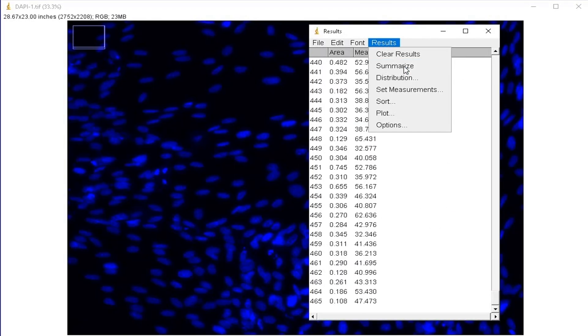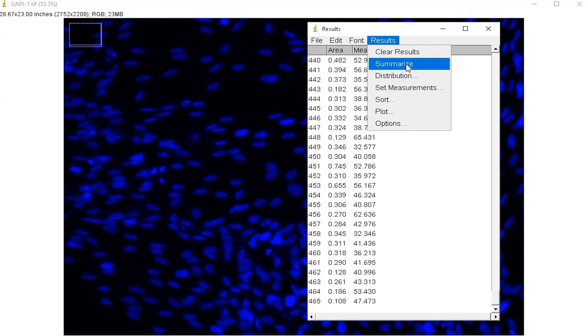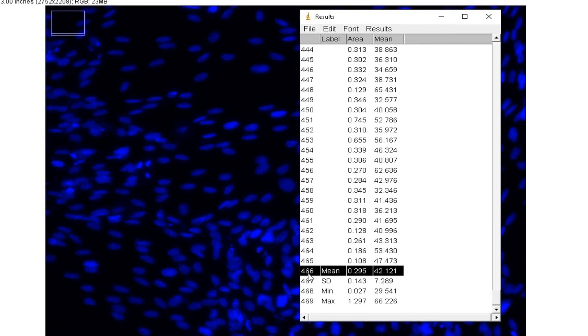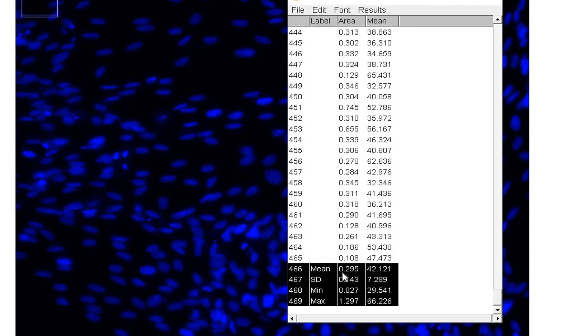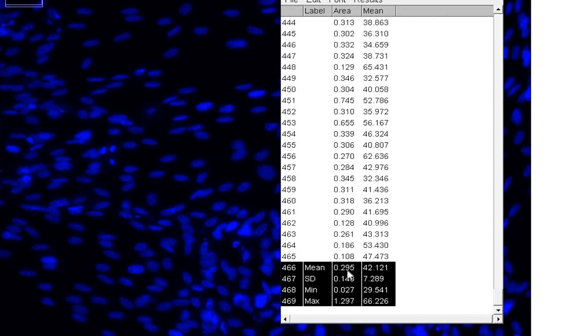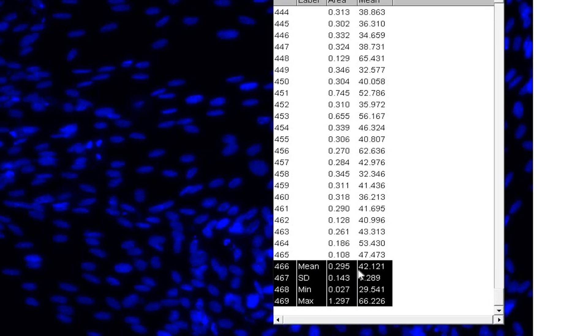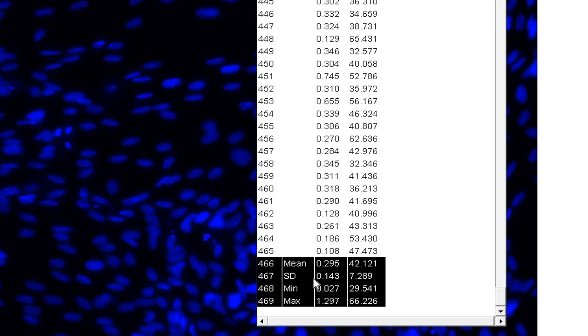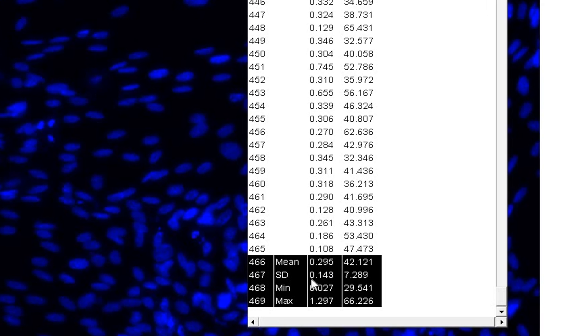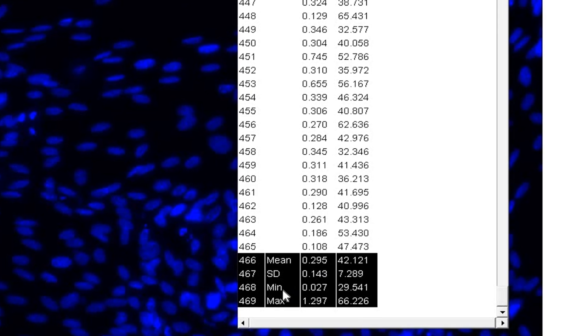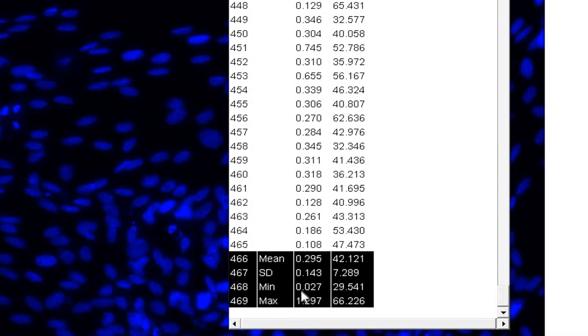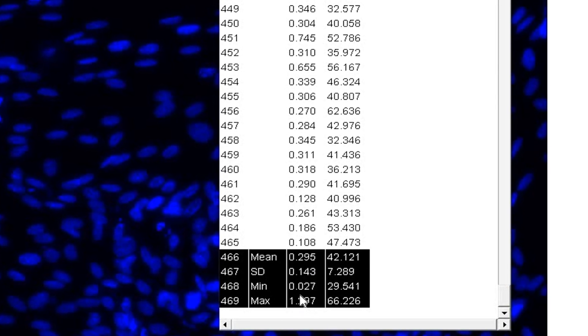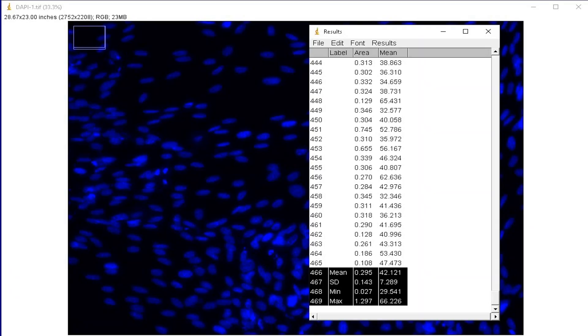Click on Results and Summarize. This step will calculate the mean, standard deviation, minimum and maximum of the area and the intensity.